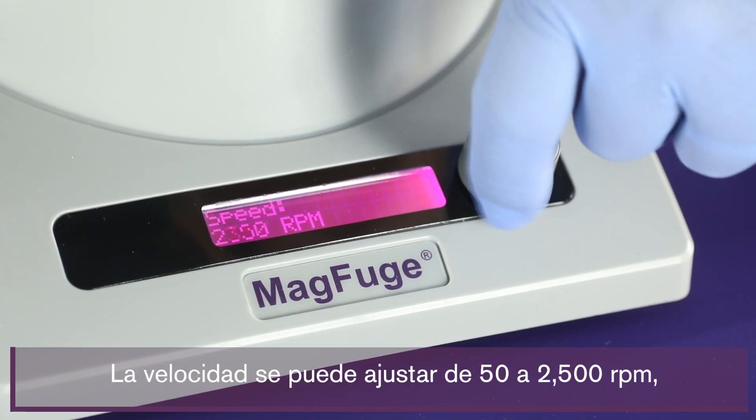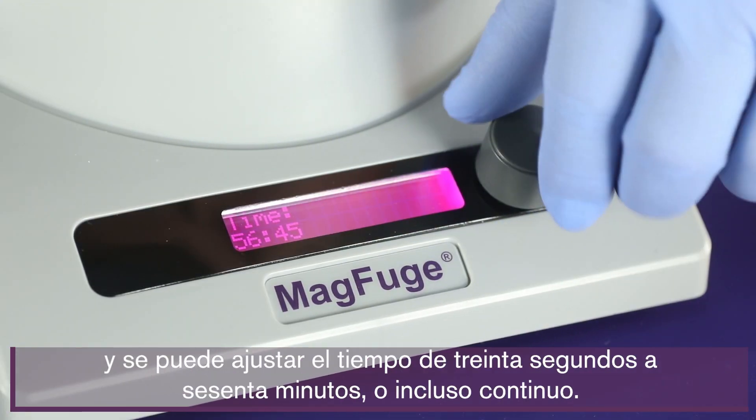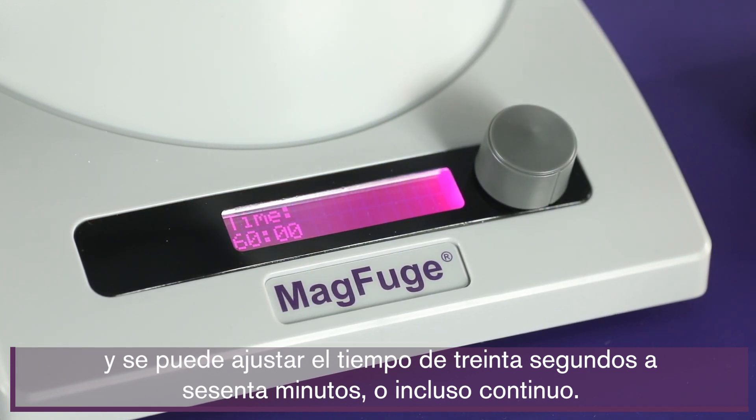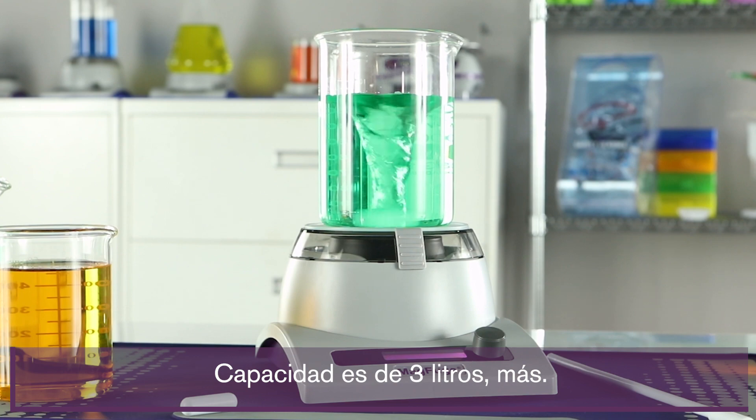Speed can be adjusted from 50 to 2,500 rpm, and you can set the time from 30 seconds to 60 minutes, or even continuous. Capacity is 3 liters plus.